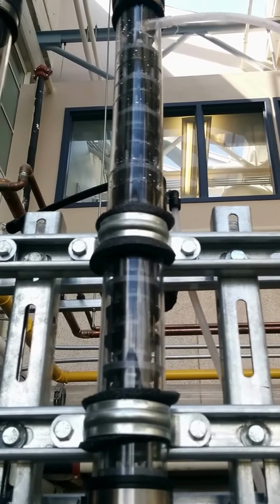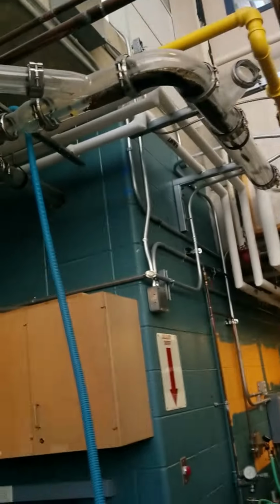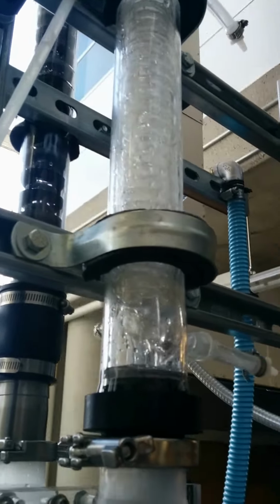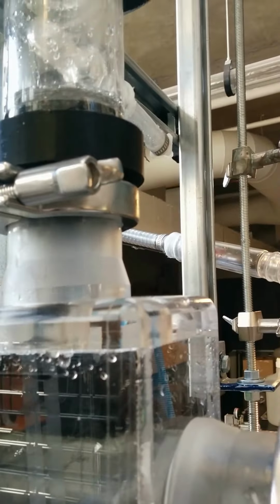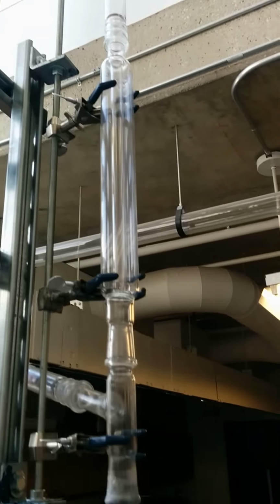Maybe you'll be able to see once you see the video that liquid in the column is good. And got a video of the other side of the column. It is going great here. Going into the thingy-majiggy. Just fine. This is our pre-vac condenser.